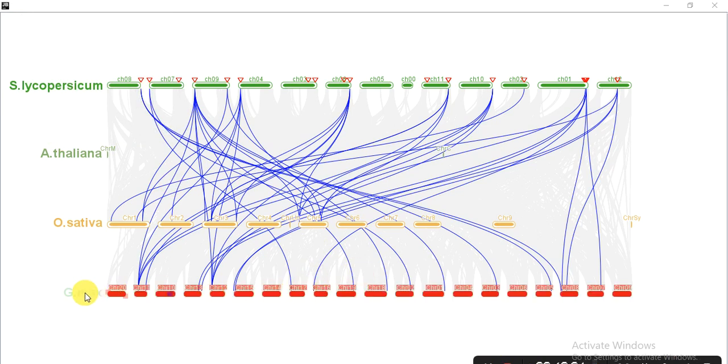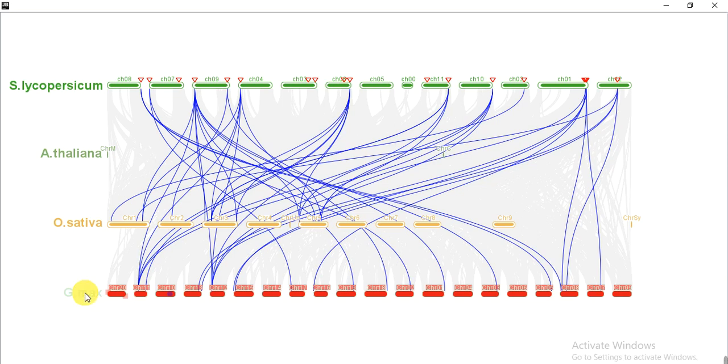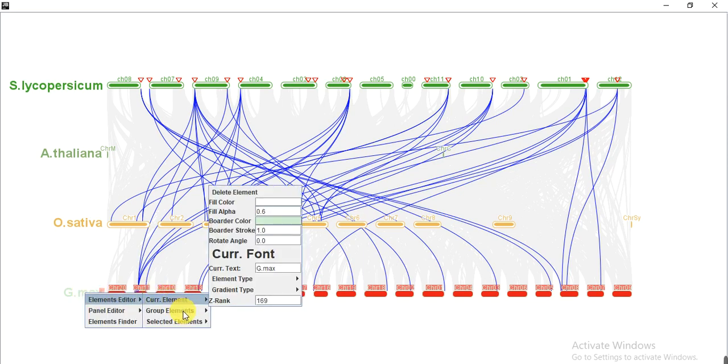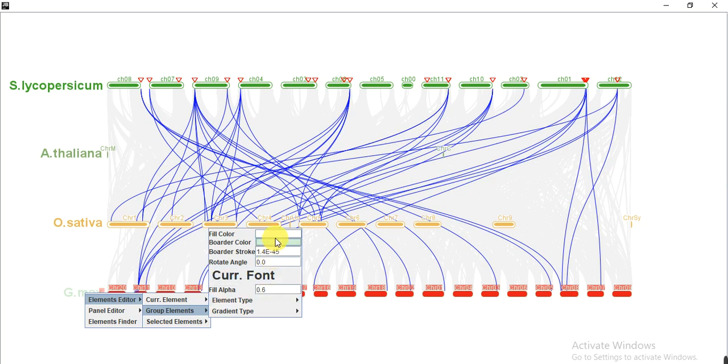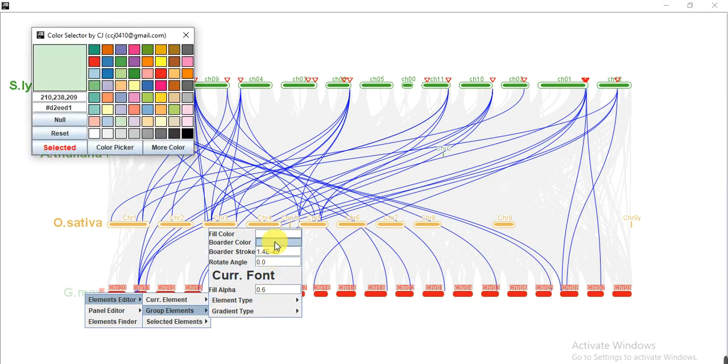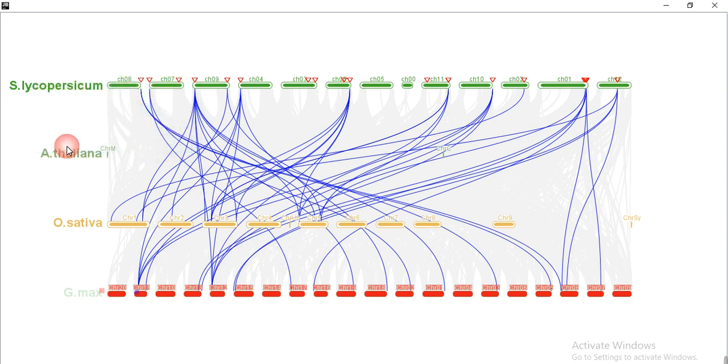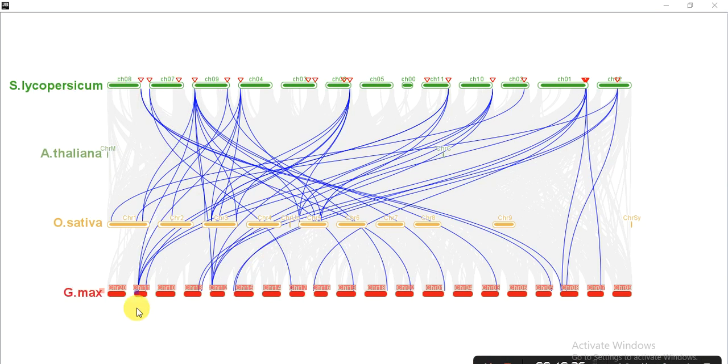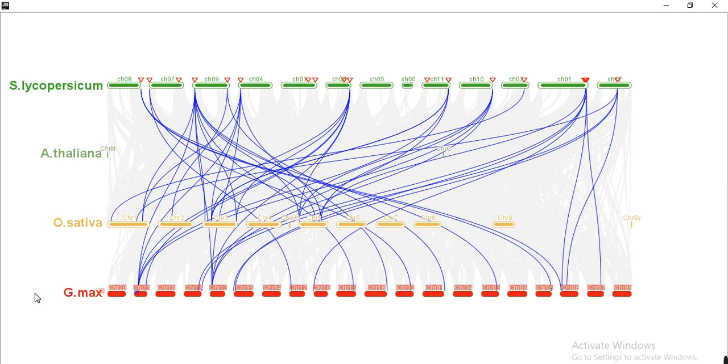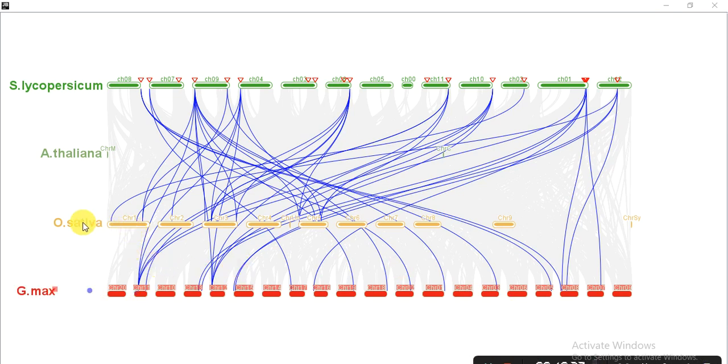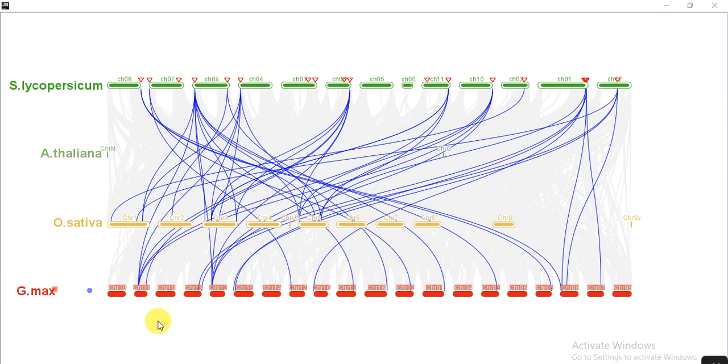So all our chromosomes become red. So I want to change the G.max color name. G.max name color, group, and here fill color. So I want red. So you can also drag it into any place where you want to keep. So in this way you can change the color of name or chromosome, whatever according to your choice.